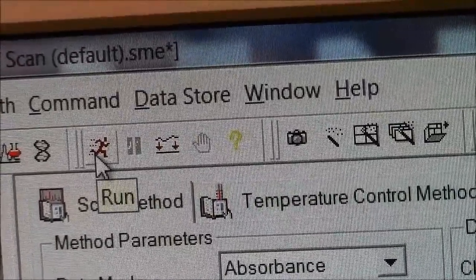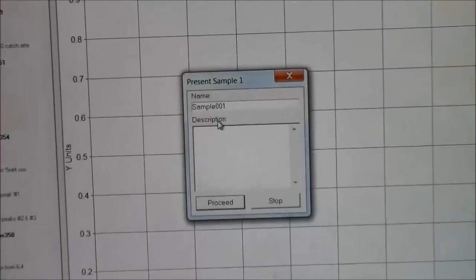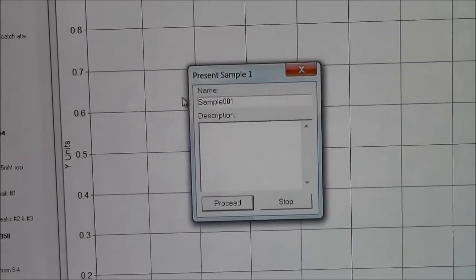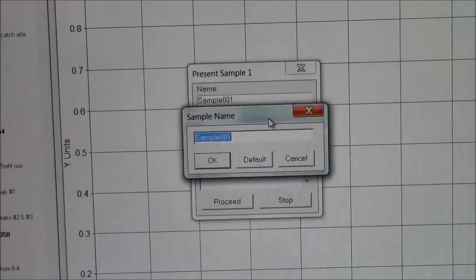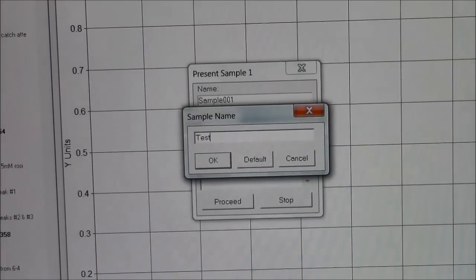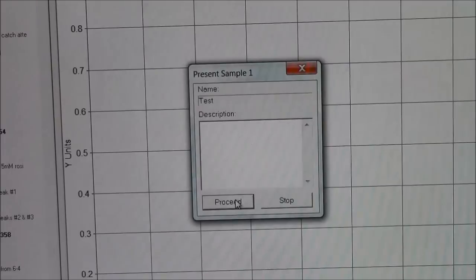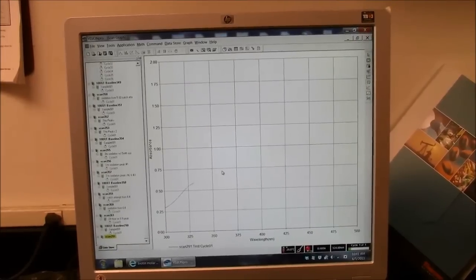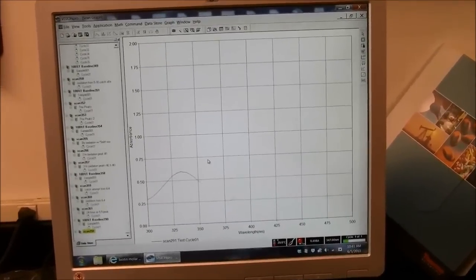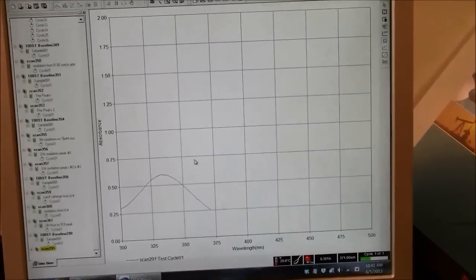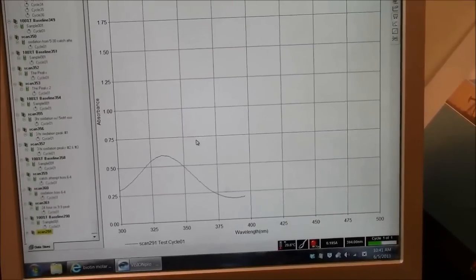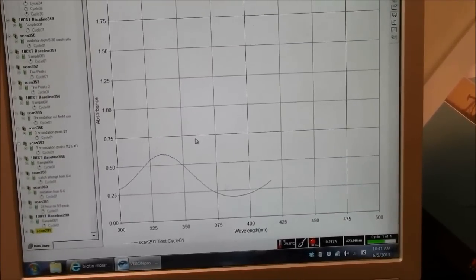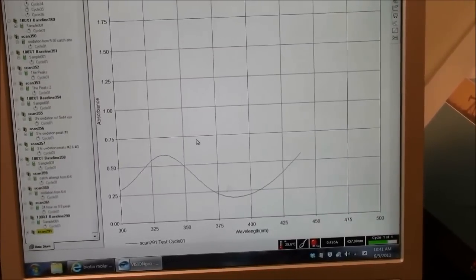And now I click on this running man. This window will pop up. Name your sample. I'm calling this test. I hit proceed. It is graphing absorbance versus wavelength for the sample that I have in the cuvette.